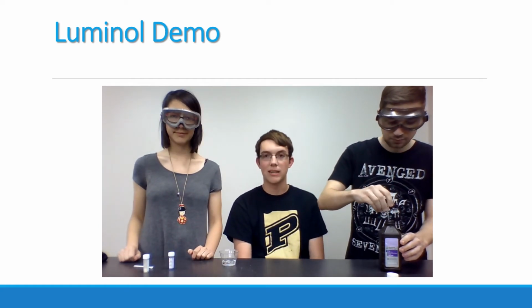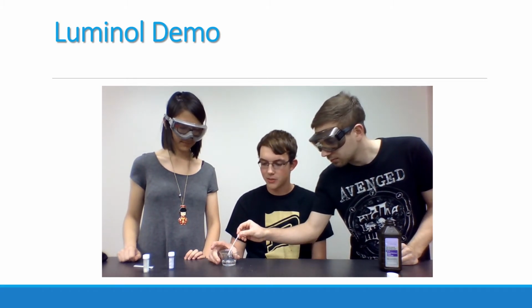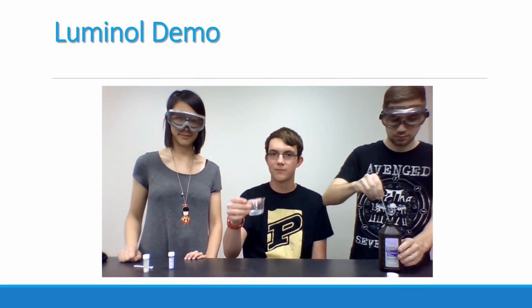Now that we have our luminol and our catalyst inside of the solution, all we need to do now is add the H2O2, and it should emit a blue light when we turn the lights off. So, observe. Add the H2O2, turn the lights off. And if you swirl it around a little bit, you'll see that a cool blue light is emitted. Now this is a cool light, which means it's not emitting any heat at all, it's just glowing blue. Now it looks like it disappeared on the screen, but you were able to see it there for a little bit. So that is today's reaction.